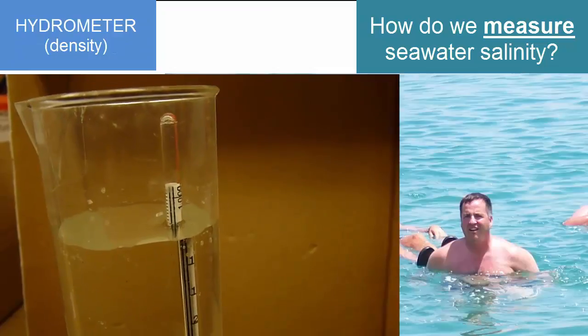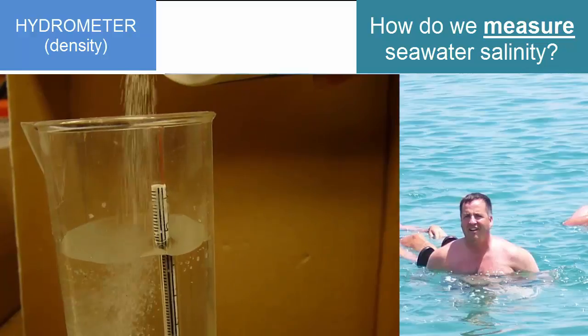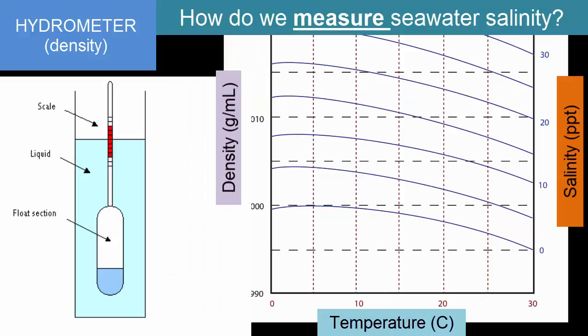If salinity increases, so too does density. So we can use a hydrometer to measure the density and, based on that, calculate the salinity that would create that density at that temperature. Temperature also affects density, so we have to correct for that as well. The hydrometer is an inexpensive tool that is easy to read and is the most common tool used for home aquaria. This graph shows you how it's used.